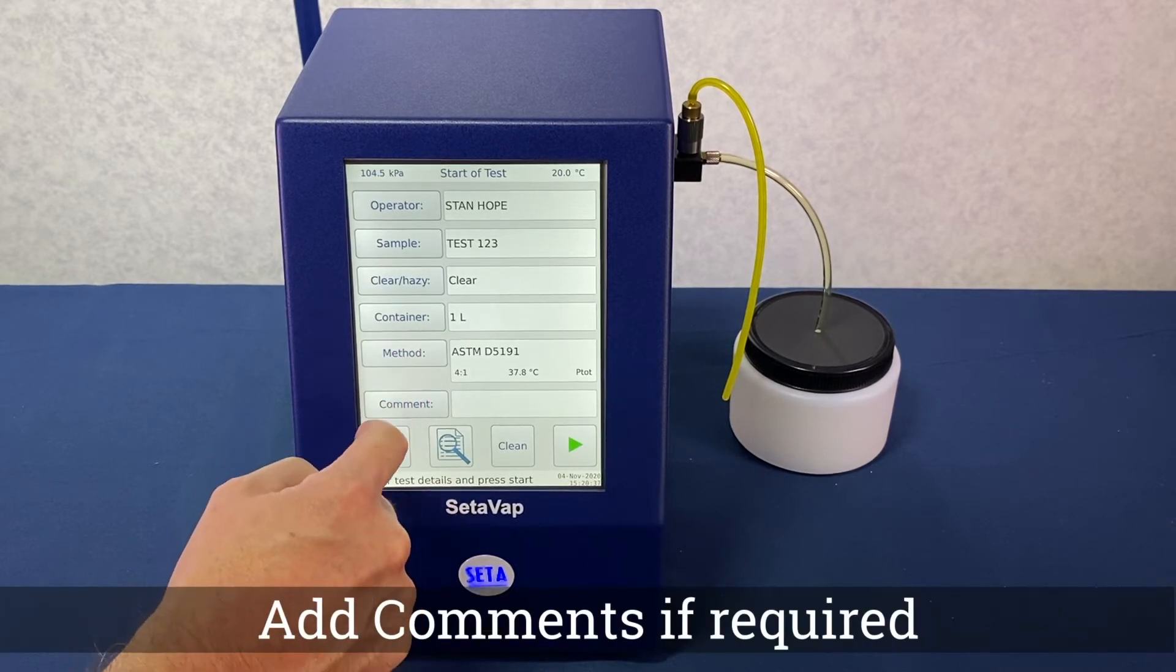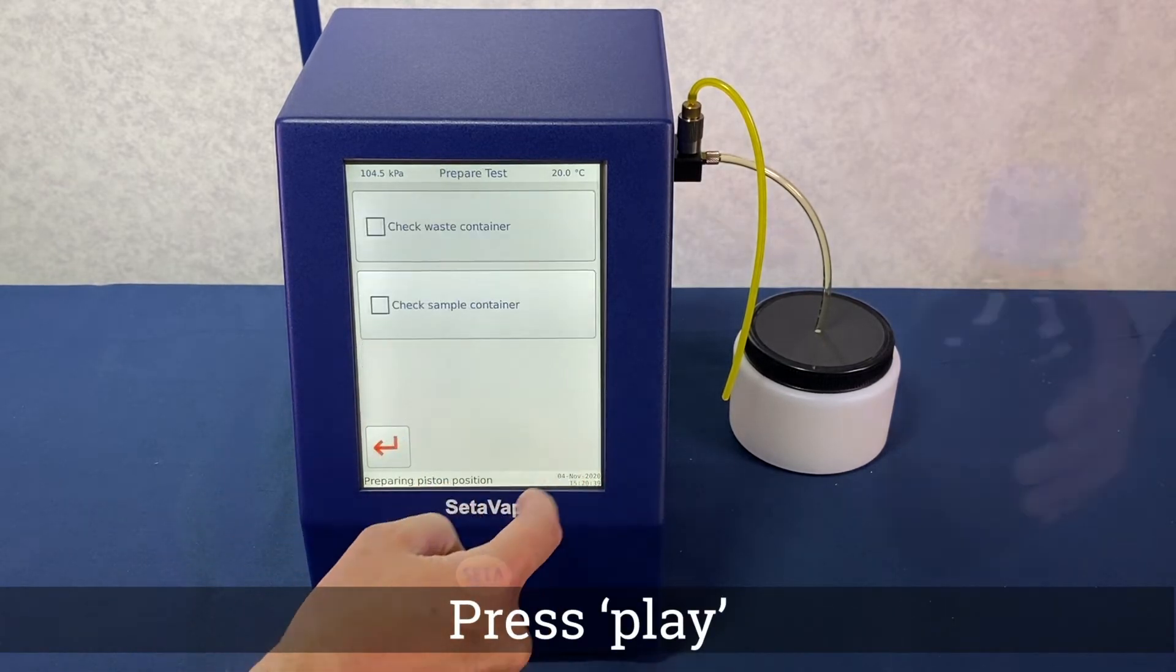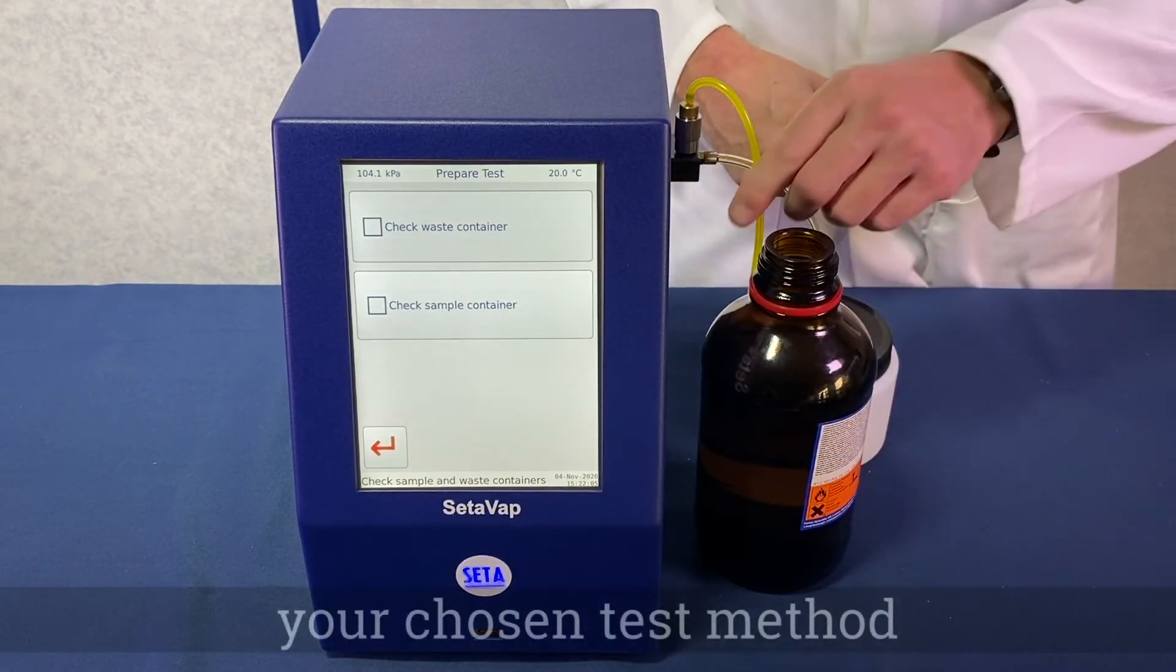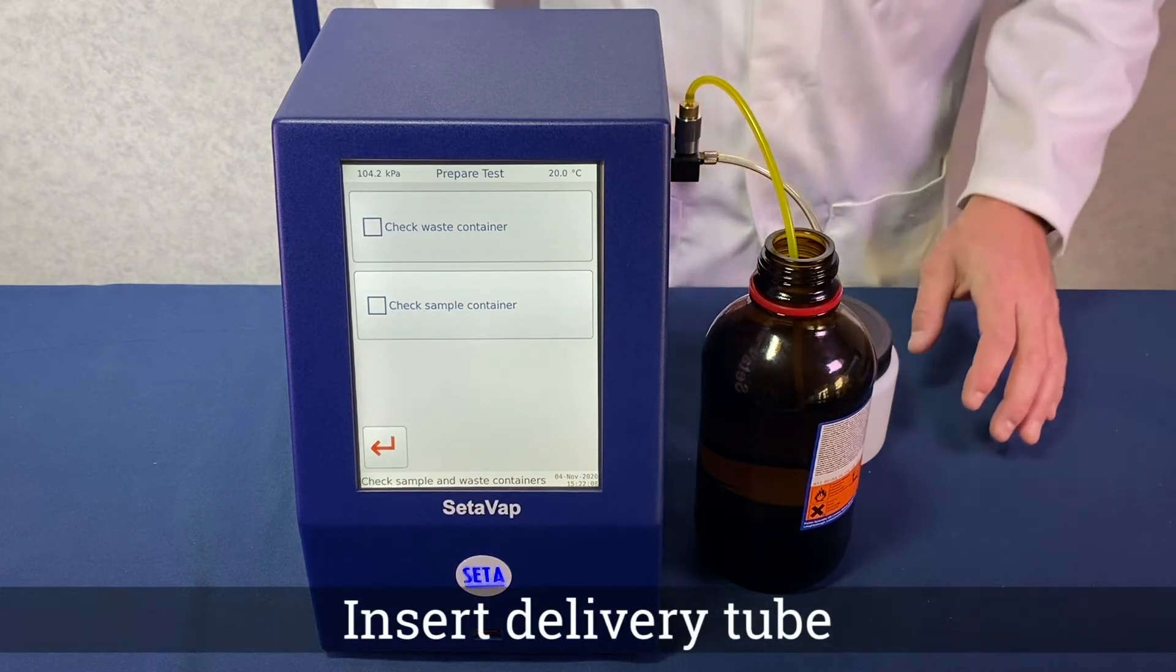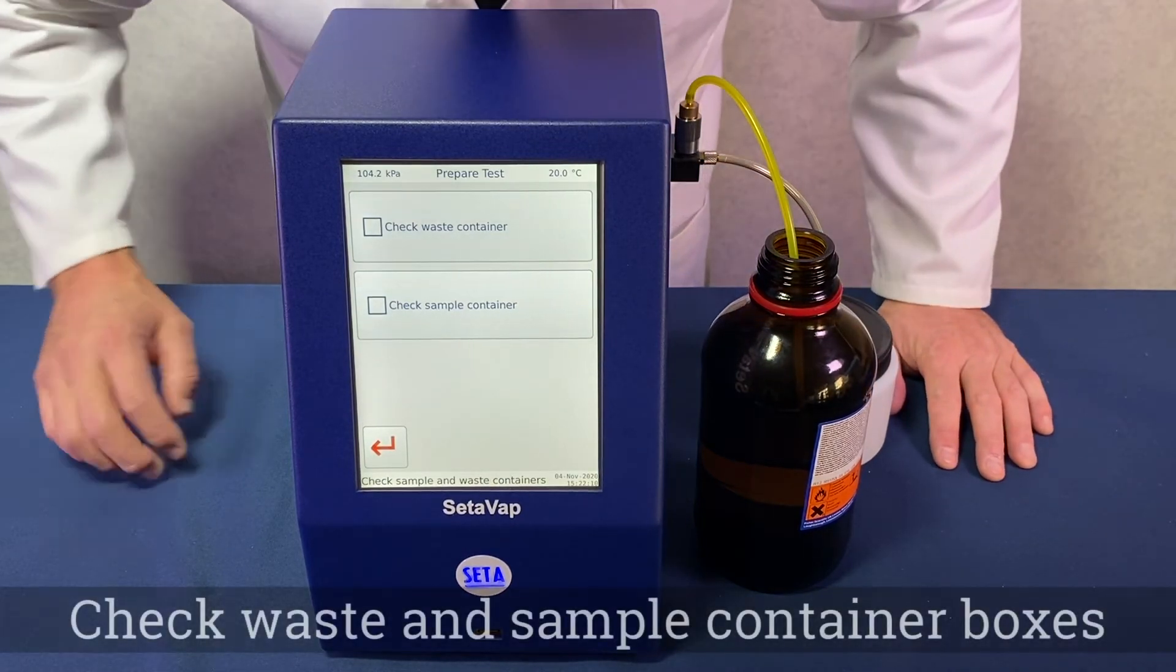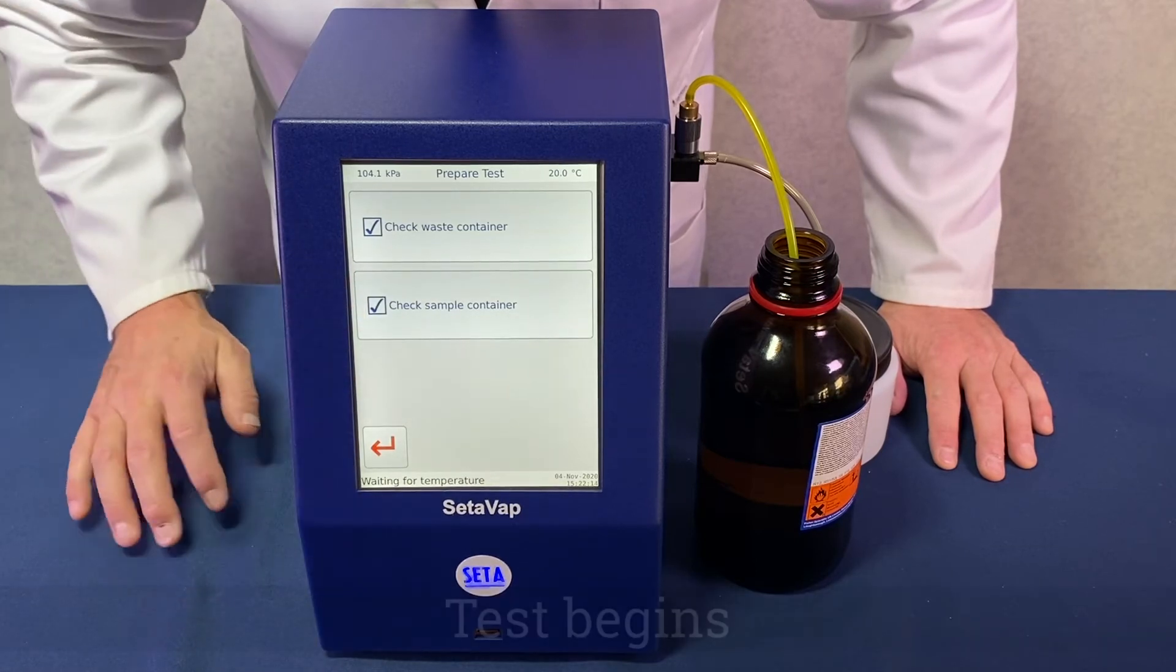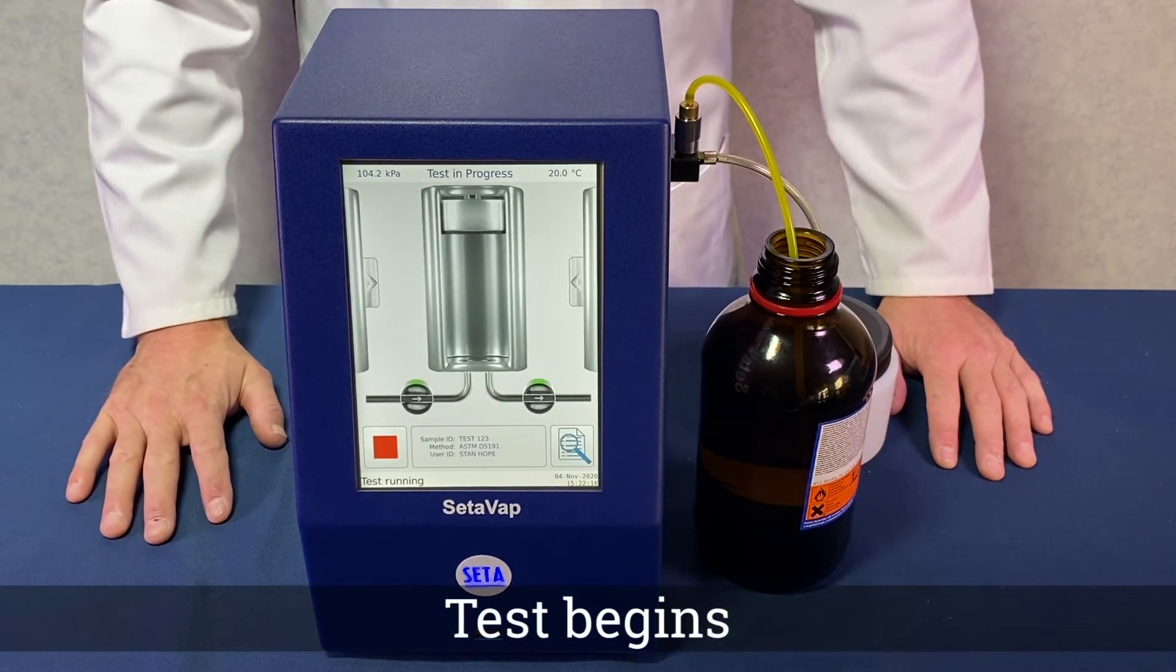Add any comments if required and then press the green play button. Having prepared your sample in accordance with the test method instructions, insert the delivery tube. Tick the waste and sample container check boxes, upon which the test will automatically start.